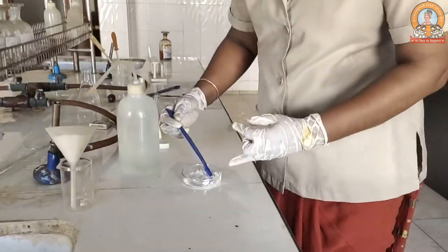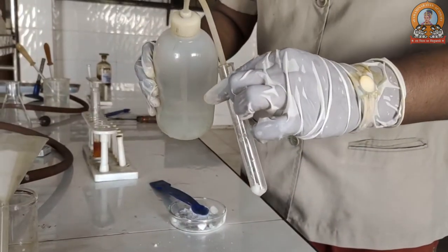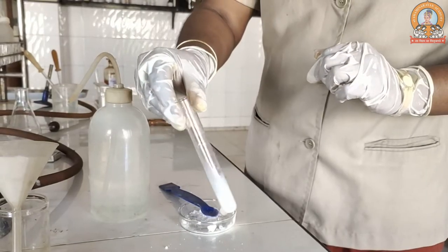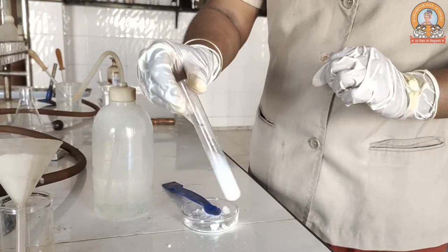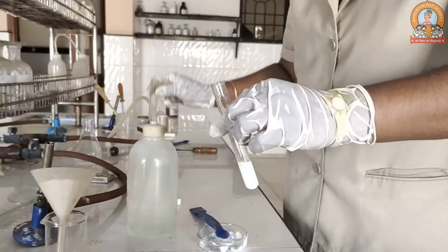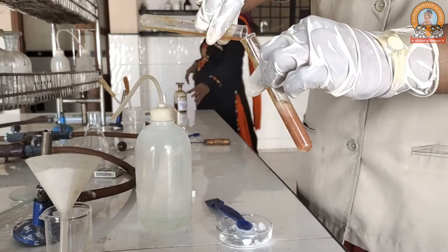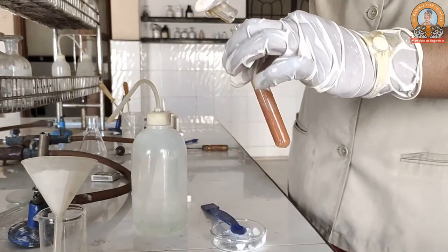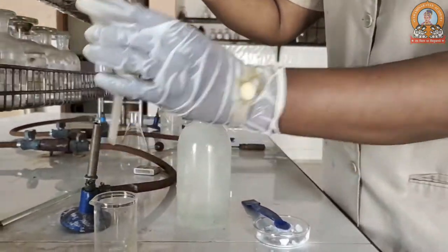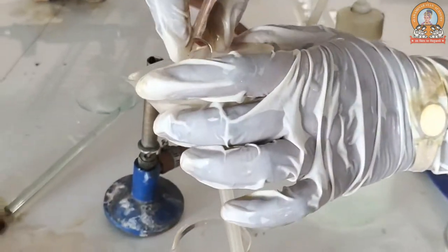We will take the salt and add a slight amount of water to form an aqueous solution. After mixing it well, you have to add neutral ferric chloride into it. It gives a brown precipitate solution, which you then have to filter using a funnel with filter paper.